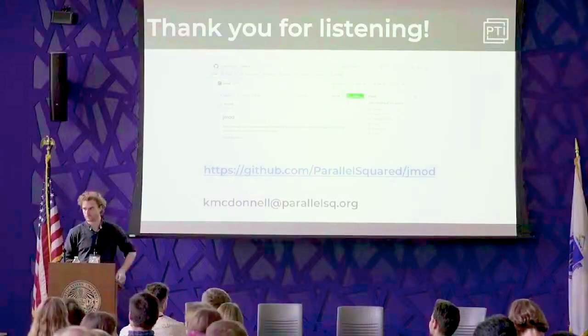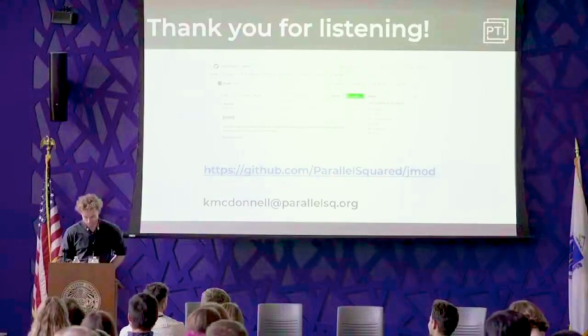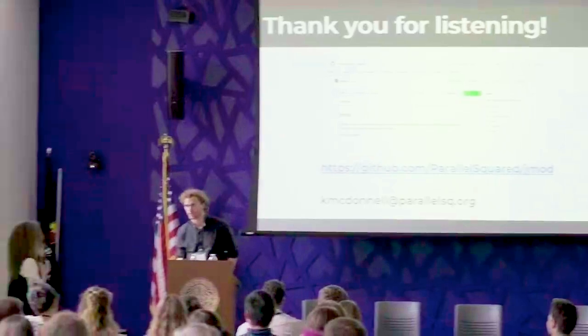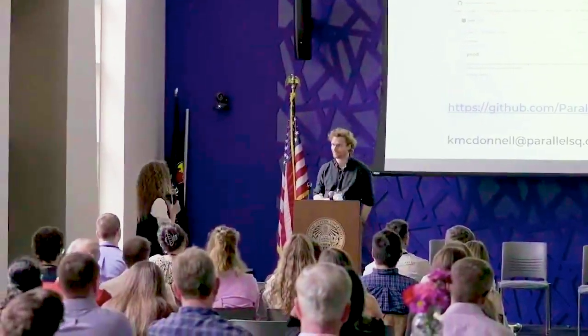I'll start with one. So we've seen 4 Dalton spacing, we've seen 2 Dalton spacing. What are the limitations to going smaller, like single Dalton offsets? This is something we've explored with non-commercially available tags previously, and for the analysis we did at the time was only on bulk, and we did get accurate quantitation. So we believe it is possible.